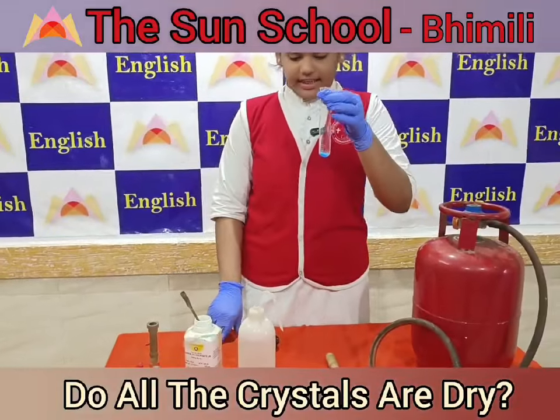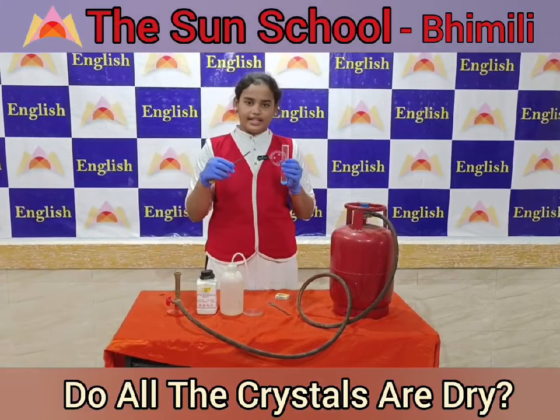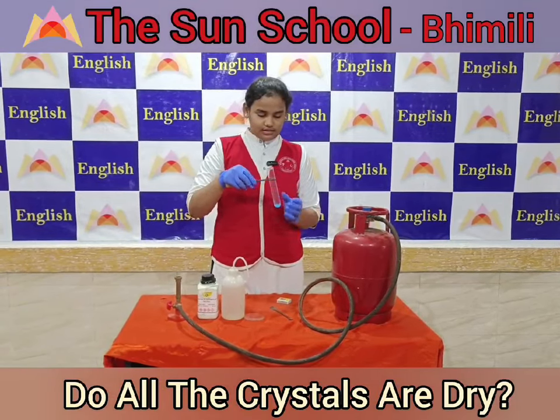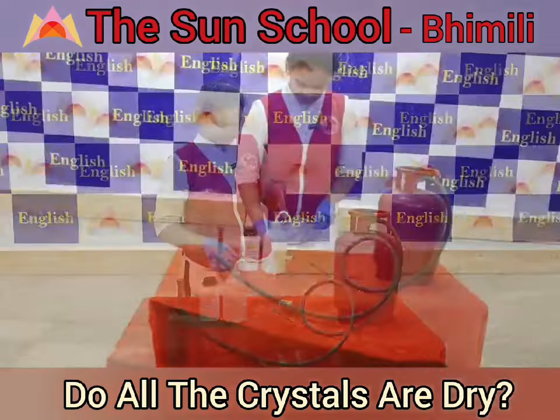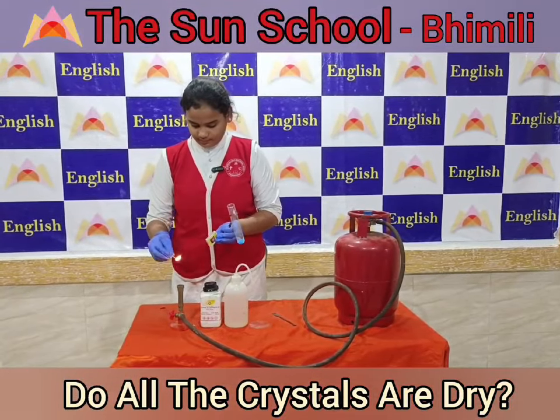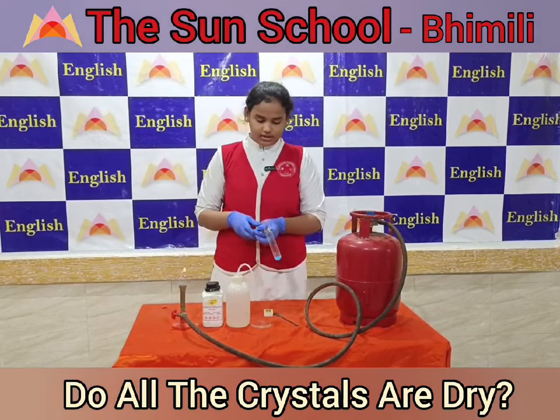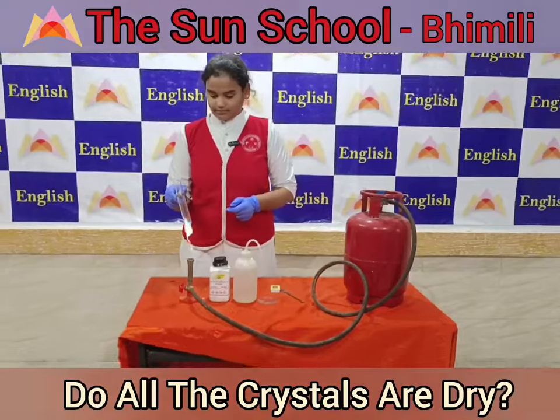Now, heat it over a flame for some time. Hold the test tube with the help of a test tube holder. Now, heat the test tube over a flame. Let it boil.